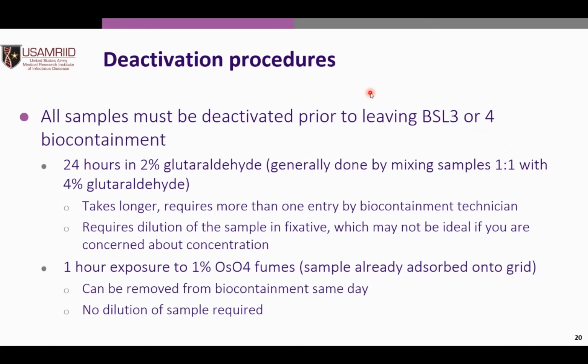This may not sound super major, but I can tell you when I go into BSL-4, like literally just to get in and then back out of the suite, it takes me about an hour, and that doesn't include time doing anything. So it can be quite time consuming to go into the suite, consecutive entries to get something done. It also requires the dilution of the sample in the fixative, which may not be a major issue, but sometimes we're dealing with samples where the original person who created the virus stock may not be really sure about the concentration of the virus to begin with. So we're a little bit averse to diluting things up front because sometimes it's easy to dilute your sample beyond the limit of detection for electron microscopy.